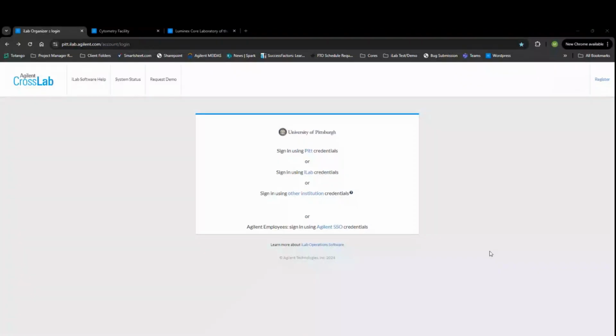Hello, and welcome to the University of Pittsburgh iLab user training. This training is for any users who will be requesting projects or services and/or reservations from a core within iLab.